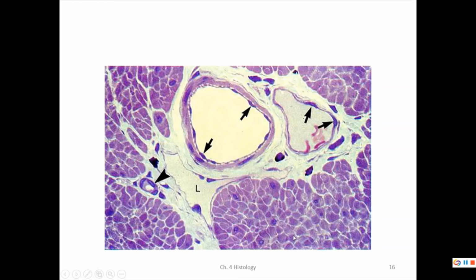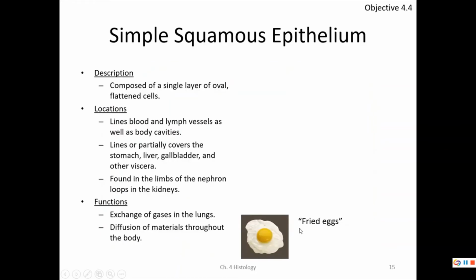And you're like, how do you know? I've been doing this for a very long time. Since I was an undergrad, I had to be able to look at this stuff and know what I was seeing. These are blood vessels found inside of a muscle. So somebody took a muscle and cut it open. These are bits of muscles.